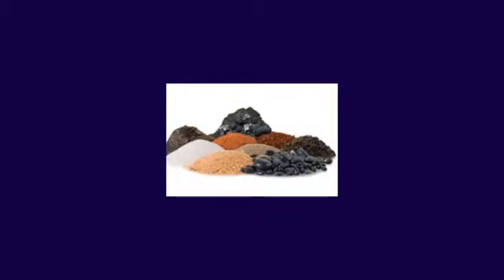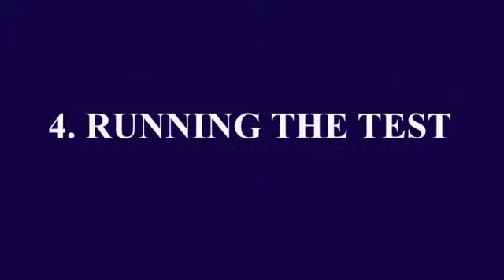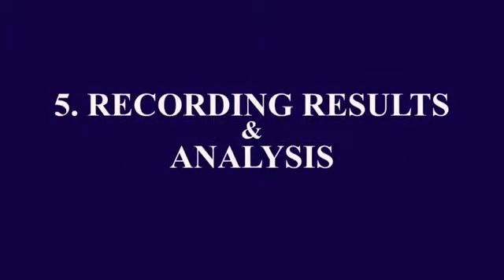There are 5 basic elements of testing: test sieves, test sieve shakers, sample materials and preparation, running the test, recording results and analysis. Test sieves.